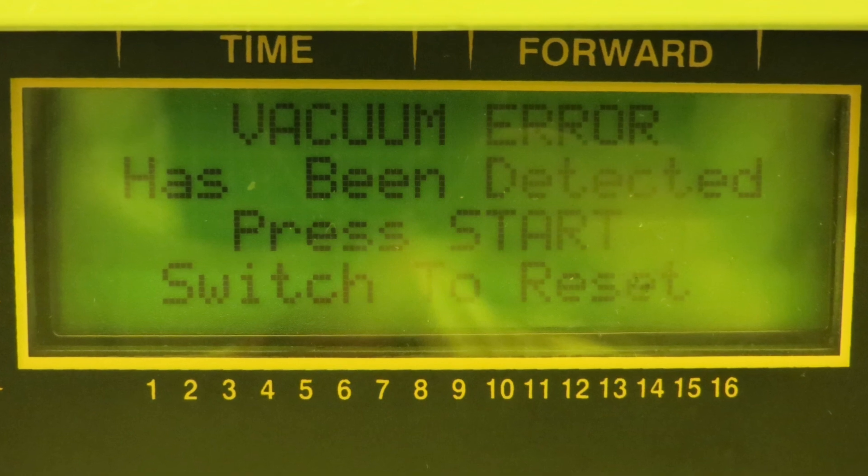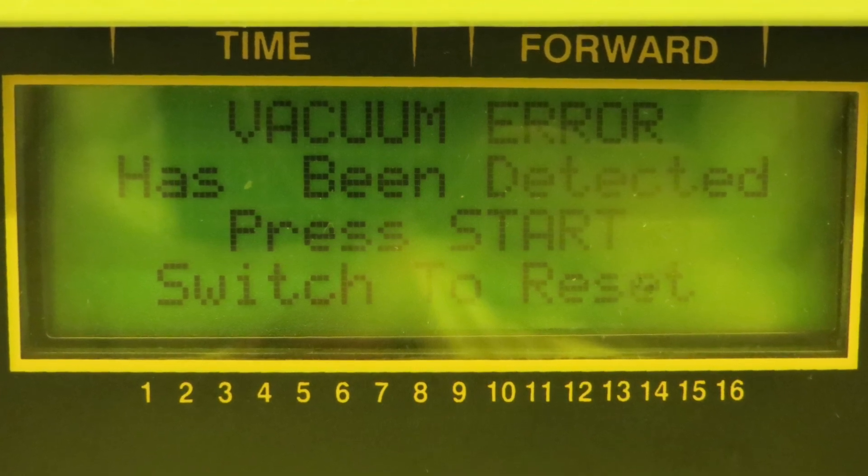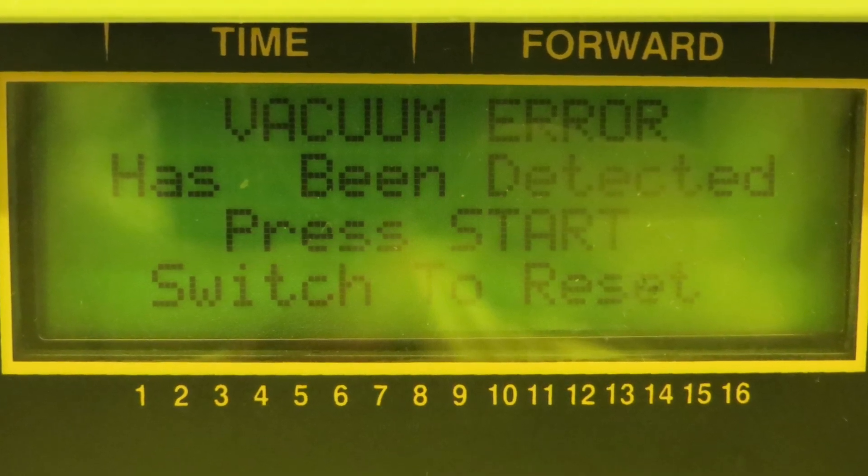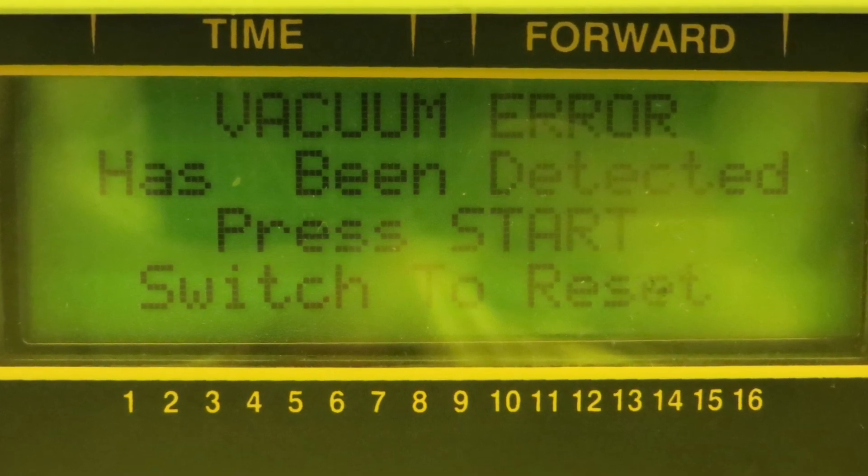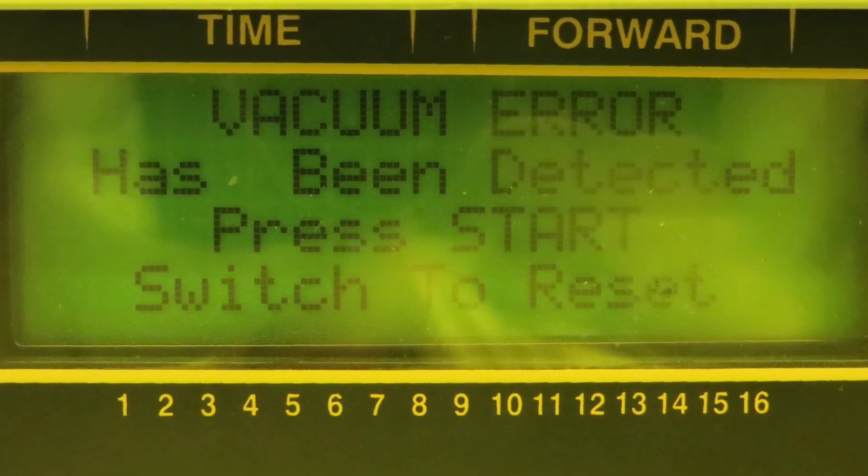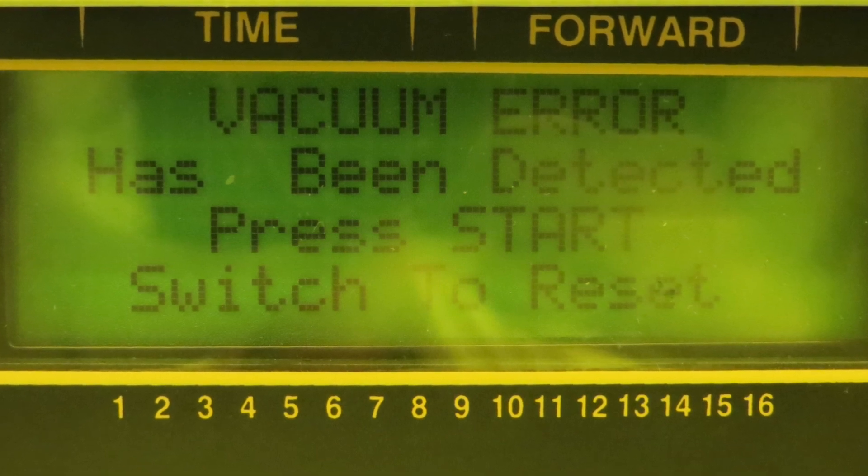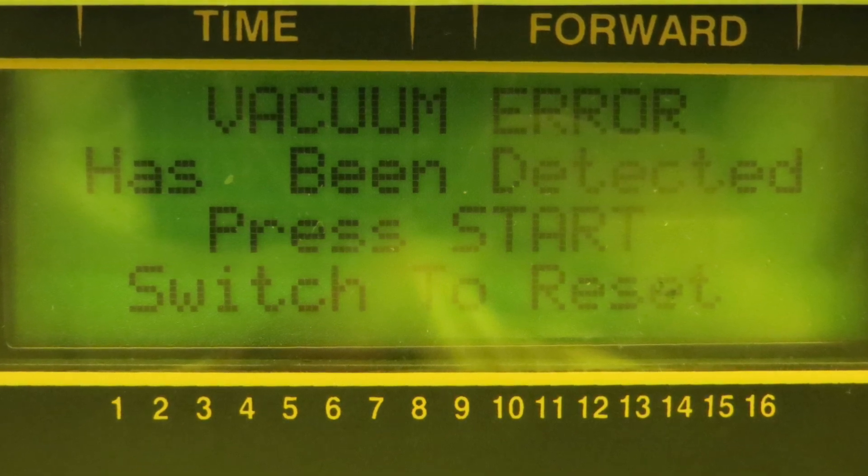If it starts to spin and you let go of the shaft, it should stop instantly if everything is normal and give a vacuum error warning. If however it keeps spinning, then that proves that the shaft is clogged or the vacuum circuit is messed up. If you feel that the shaft is clogged, please notify the lab supervisor right away.